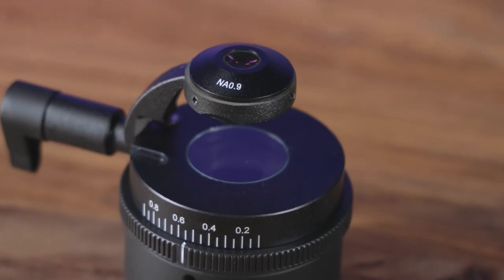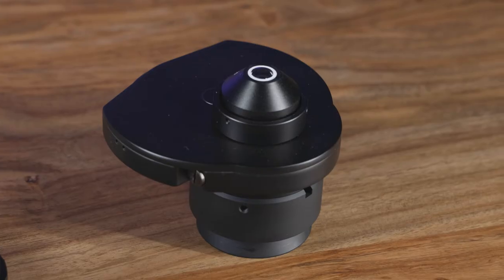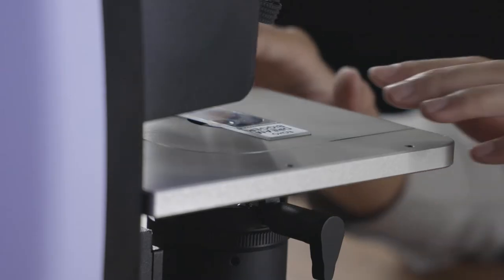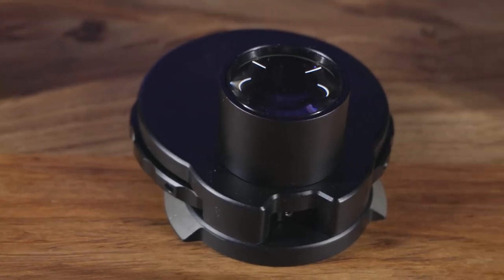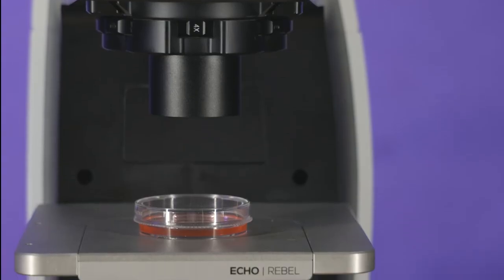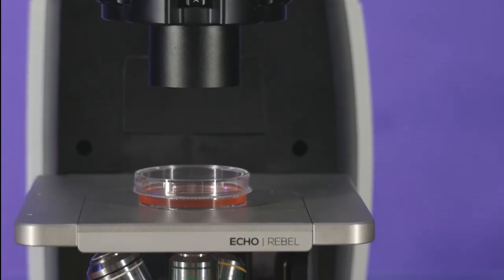REBEL has three condenser options: a high-resolution flip-out phase condenser for viewing glass slides in the upright configuration, or a long working-distance condenser for brightfield or phase applications in upright or inverted.